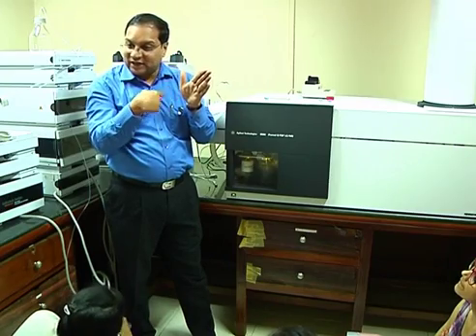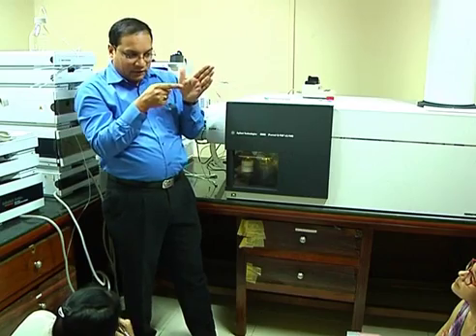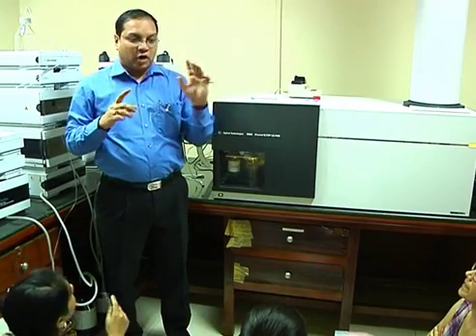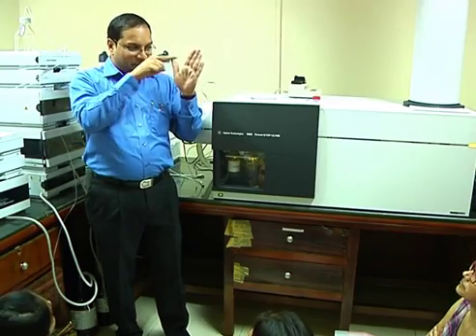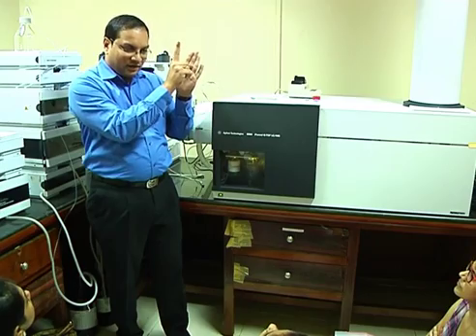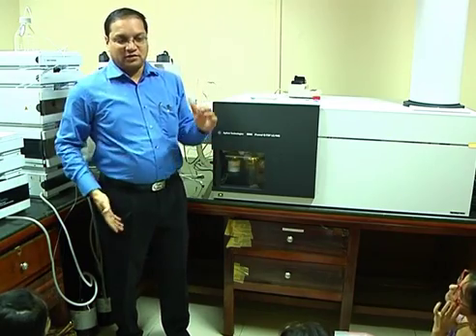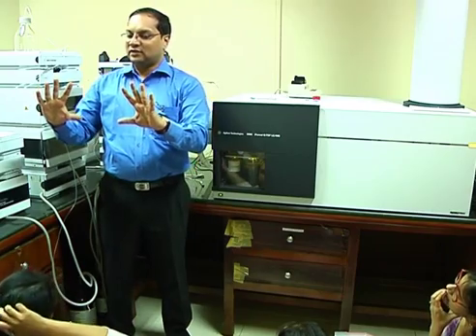That is why it is in tandem, it is talking. It has scanned, it has told to pick 8, and by coming back, it will pick up only those 8 in the same cycle, fragment those and give it back. So now the TOF will stitch the information because it has the scan, it has the MS of the 8. So it knows which are the precursors at MS level, and it knows what the fragments of that precursor are. So it will stitch the data, so it will have an MS and MS/MS of that peptide stitched together, and as a user, I can see it comfortably on my desktop.